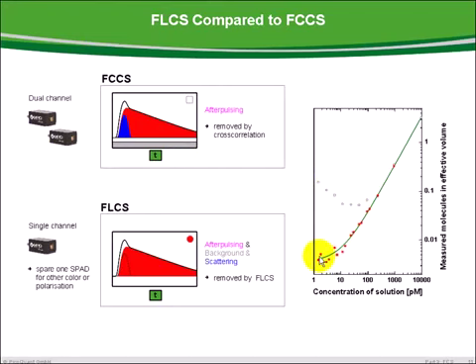At very low concentrations, the curve bends. We had to use some very diluted soap solution in order to prevent the aggregation of the dye molecules onto the container walls. The soap is slightly fluorescent, leading to the small offset which results in the bending of the curve.